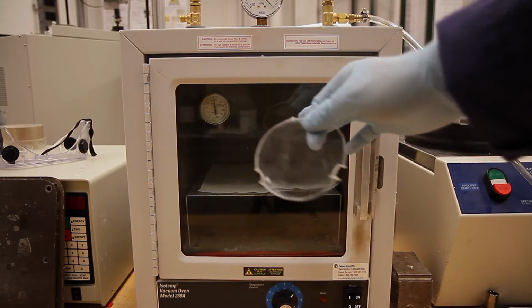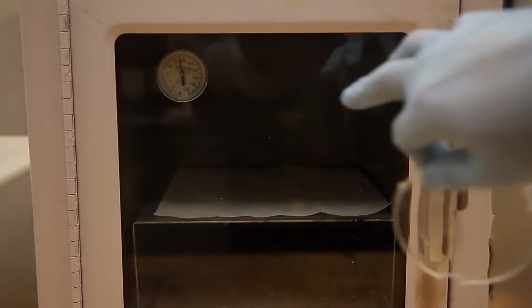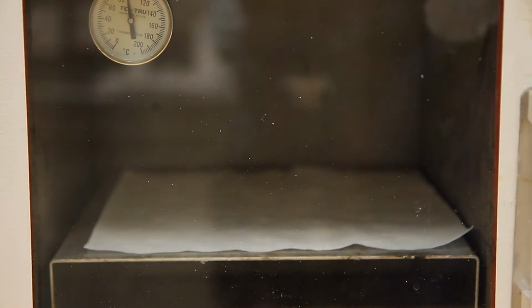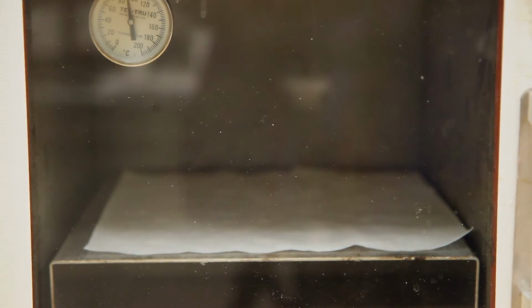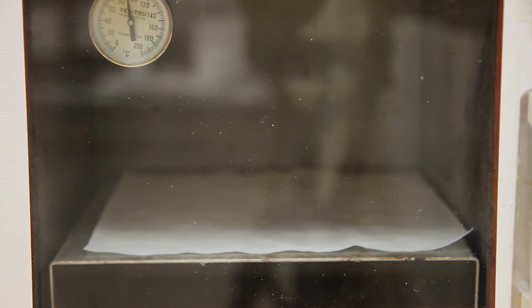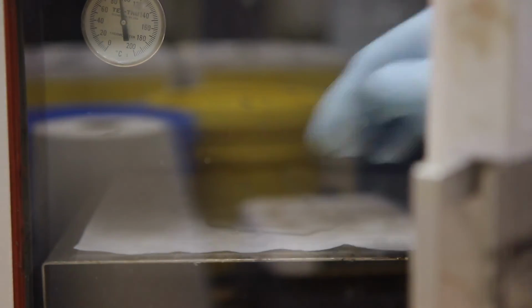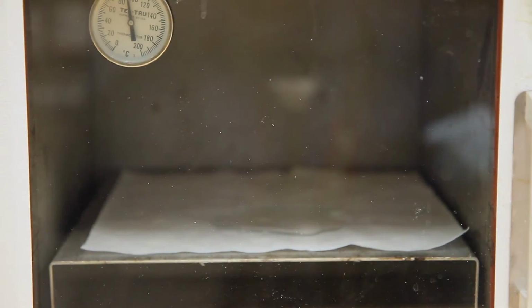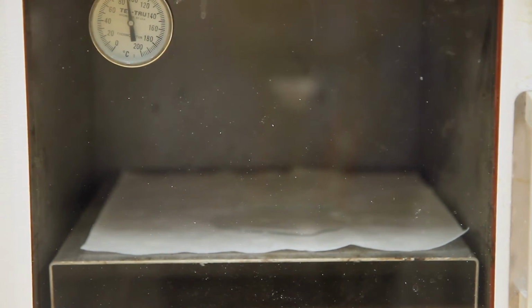I will now put this sample into the oven. The temperature is now pointing at 90 degrees Celsius, which is approximately 30 degrees Celsius higher than the glass transition temperature. It takes about 15 seconds for it to be heated up. We would see the shape memory polymer effect soon.